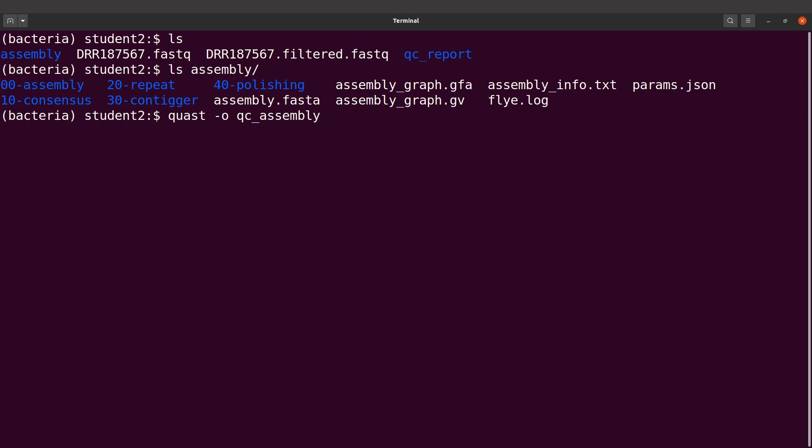I'm also going to indicate the number of threads. I'll say --threads, I'll say four. Now the threads, you can use more than four if your PC supports it. I am going to indicate the input file, which is the assembly. I'll say assembly/assembly.fasta. This is my assembly file.